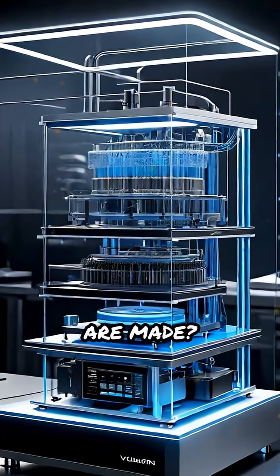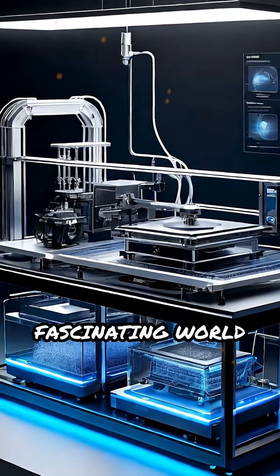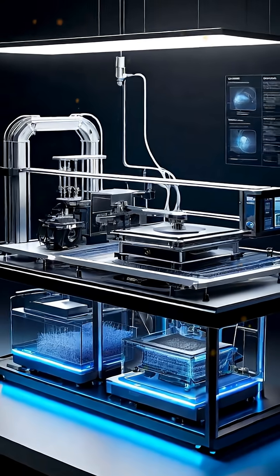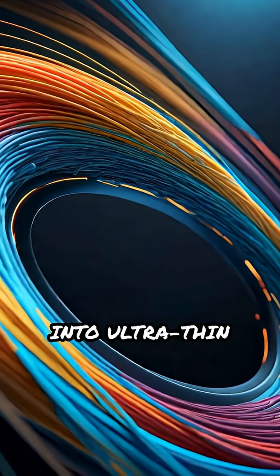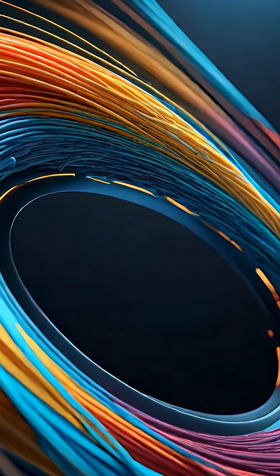Ever wondered how nanofibers are made? Let's explore the fascinating world of electrospinning machines. This advanced device transforms liquid polymer solutions into ultra-thin fibers, often just nanometers wide.